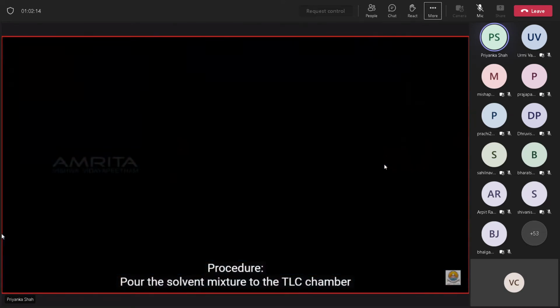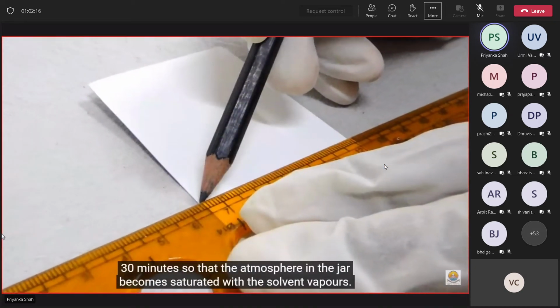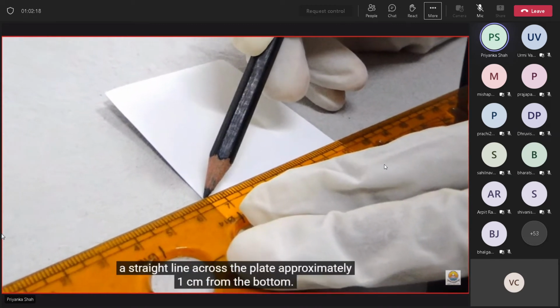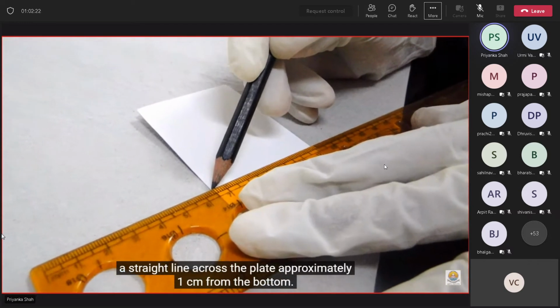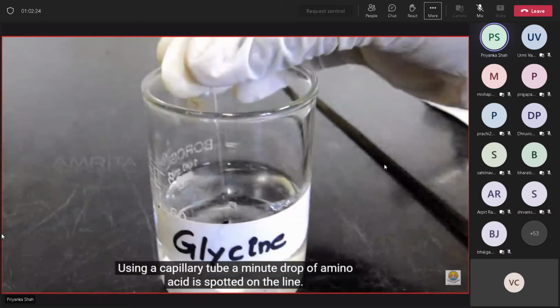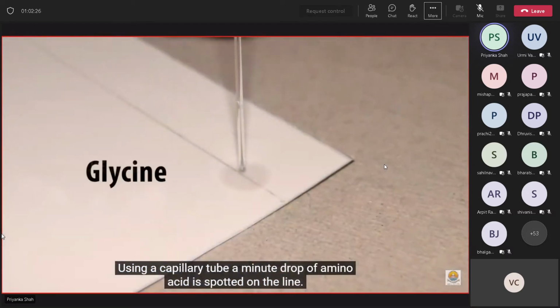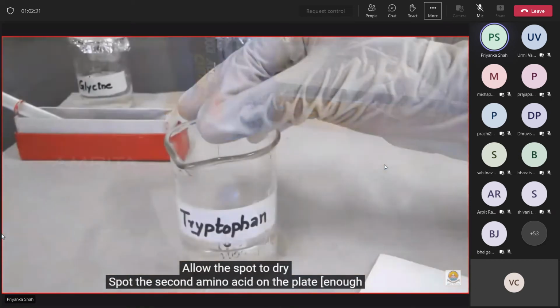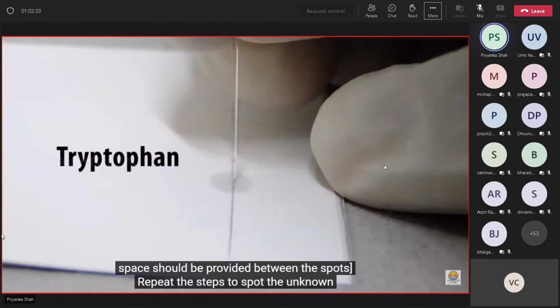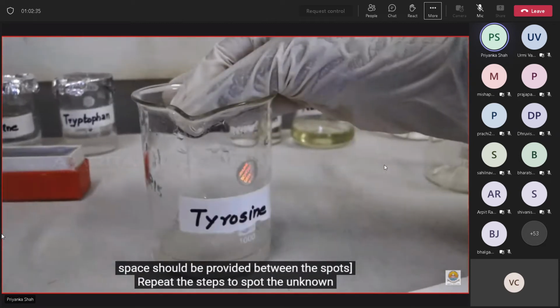Procedure: cut the plate to the correct size and, using a pencil, gently draw a straight line across the plate approximately 1 centimeter from the bottom. Using a capillary tube, a minute drop of amino acid is spotted on the line. Allow the spot to dry. Spot the second amino acid on the plate. Repeat the steps to spot the unknown.